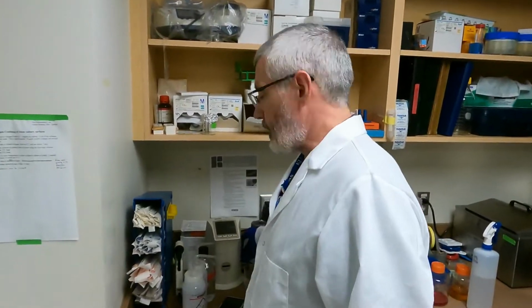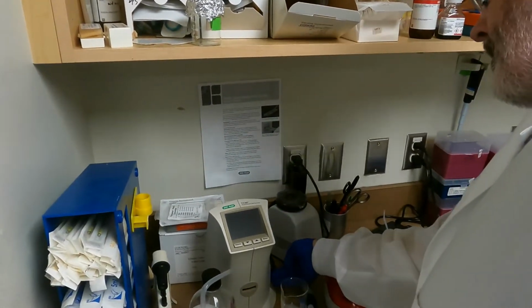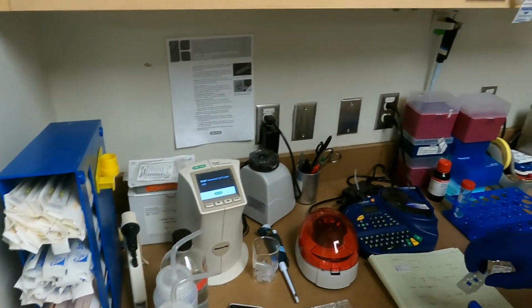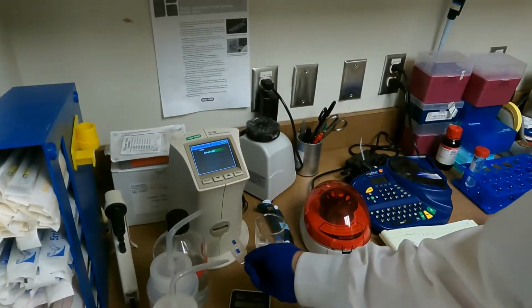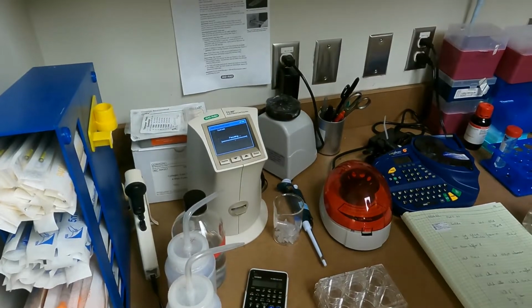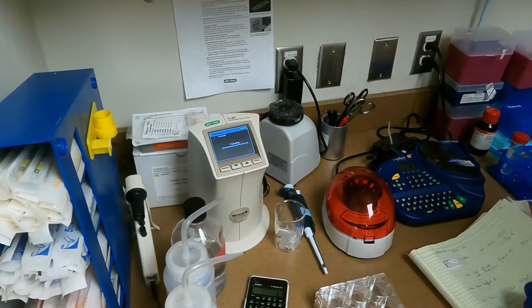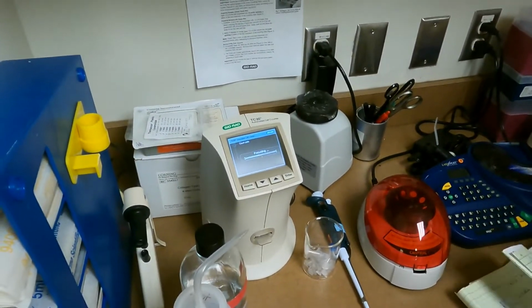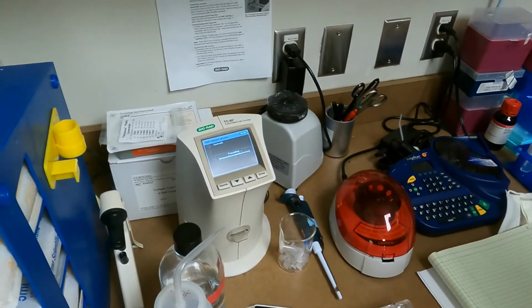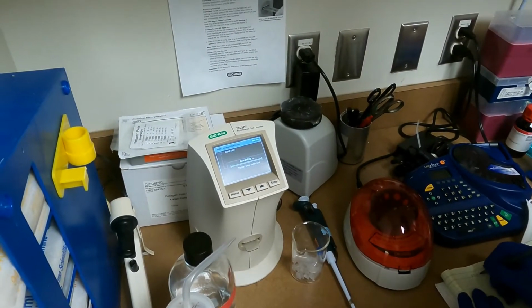Okay, so here we're going to use a cell counter. It's a Bio-Rad TC20. Switch it on. Okay. And then these cassettes just slot straight into it. It just says count cells, it's automatic. It's focusing. Oh goodness, pen. Then we've got to write this down. So we need to view each from the laptop. So what's today's date again? Today is 18th. Right now, so 9, 18, 22.